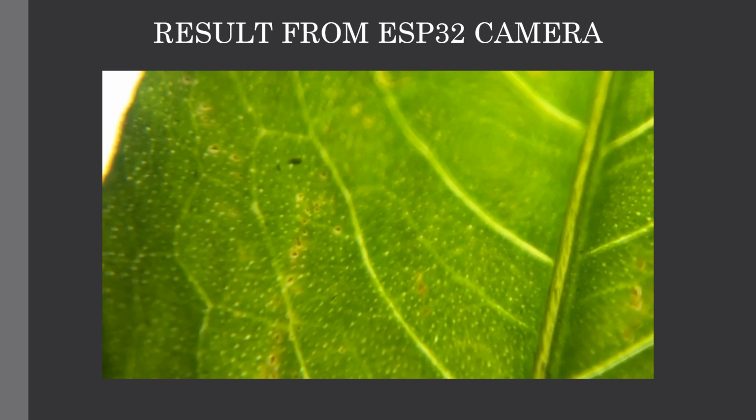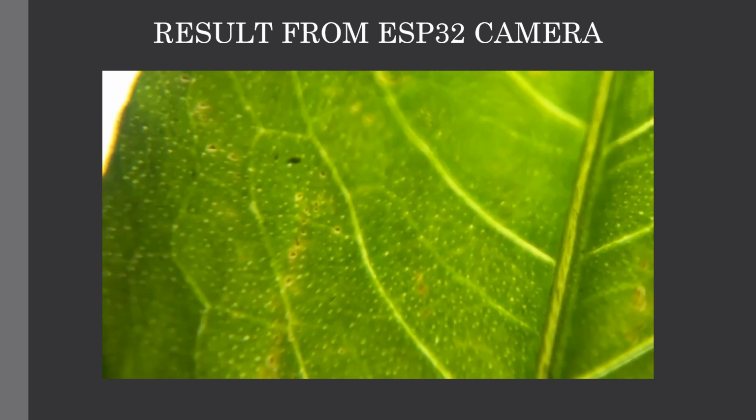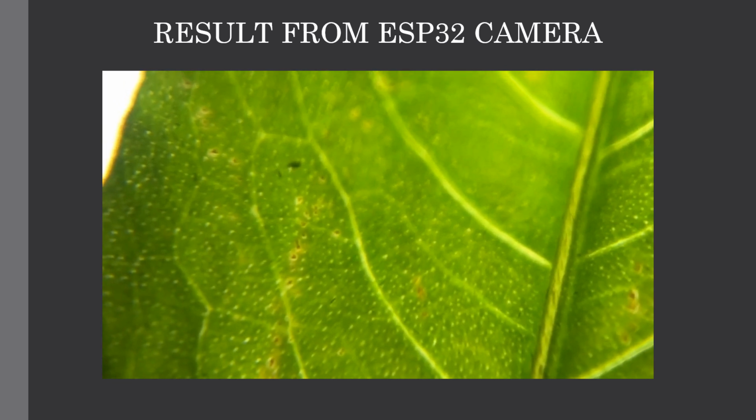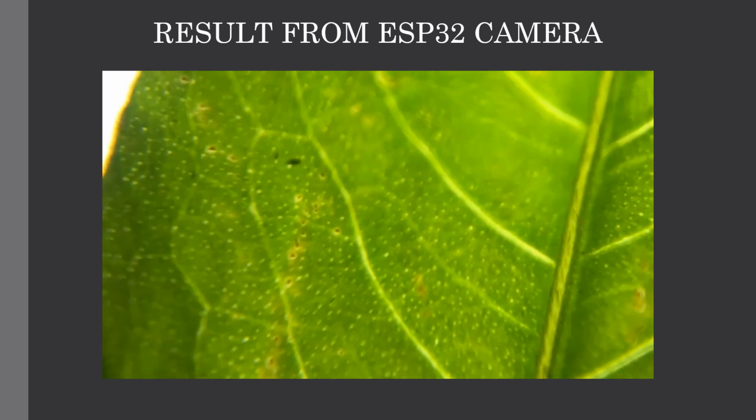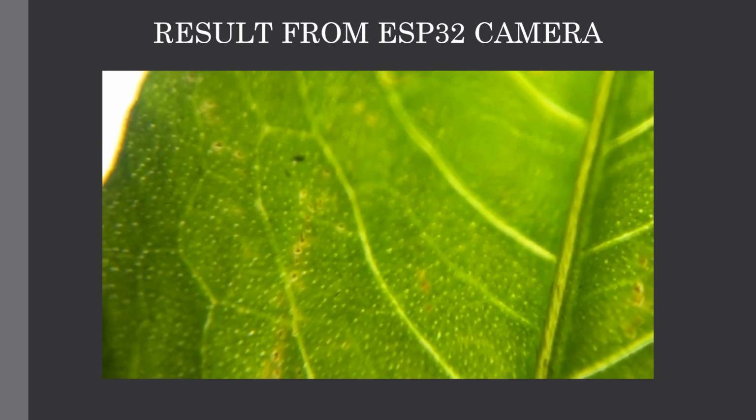This is the result from the ESP32 camera. We can observe that there's a microorganism in the leaf, and we can also see the cells of the leaf.